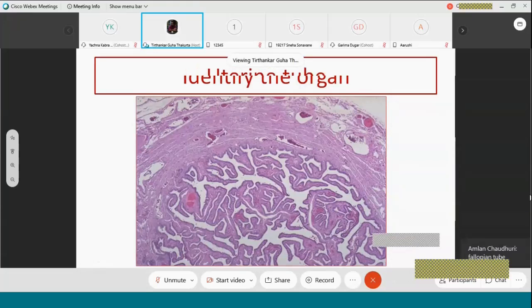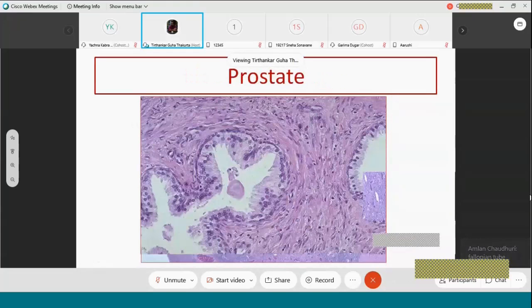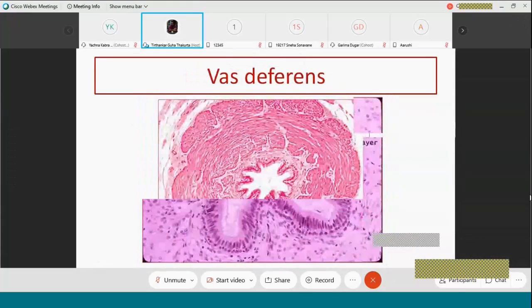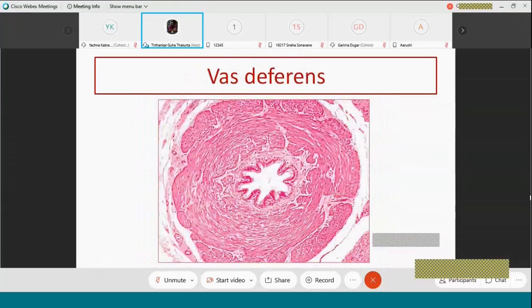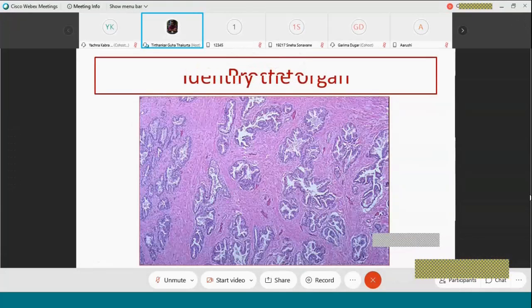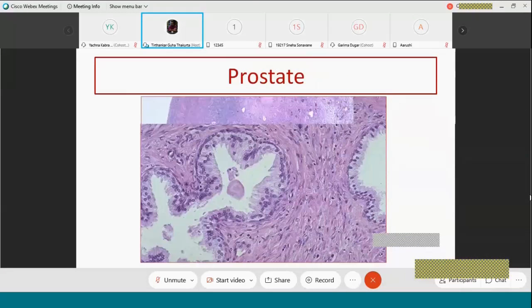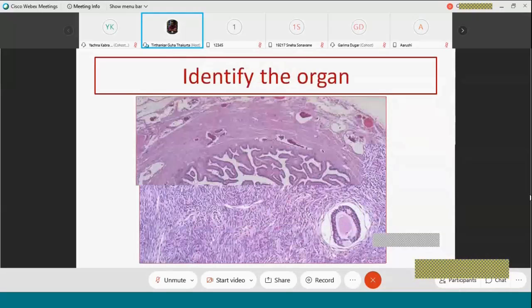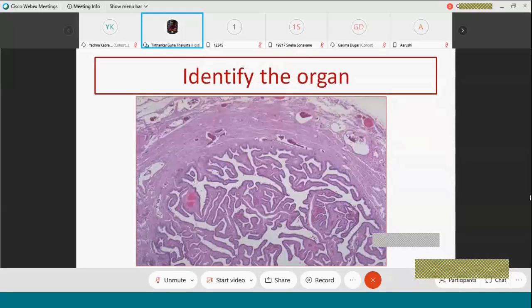Now you can compare and easily understand why I said that looking at the vast difference, you should not confuse it with fallopian tube. The vas deferens has a very simple undulation. It does not look so complicated like a maze or labyrinth, but you can see a very labyrinthine pattern of convolution that is present in the uterine tube. It's so characteristic that if you see it once, you will not forget it. So this is how the uterine tube or the fallopian tube looks like.